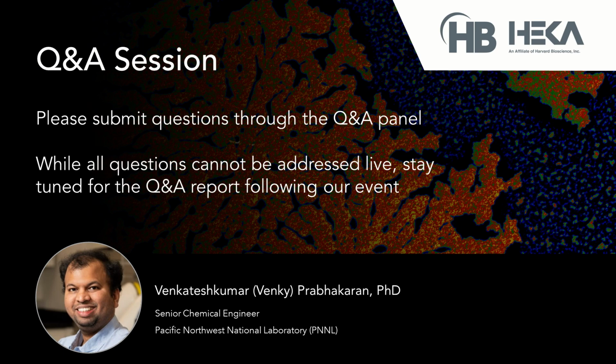Excellent. All right. In the interest of time, we'll just have one last question, looking forward. Venky, are there any developments in the field that you're especially looking forward to in the next 5 or so years? I would love to see how this technique can be combined with spectroscopy, especially other modes of spectroscopy like Raman or IR, which really enables characterization not only in electrochemistry but correlating that with the structural changes. There are plenty of advancements going on in light spectroscopy, so I would love to see more developments on that aspect.